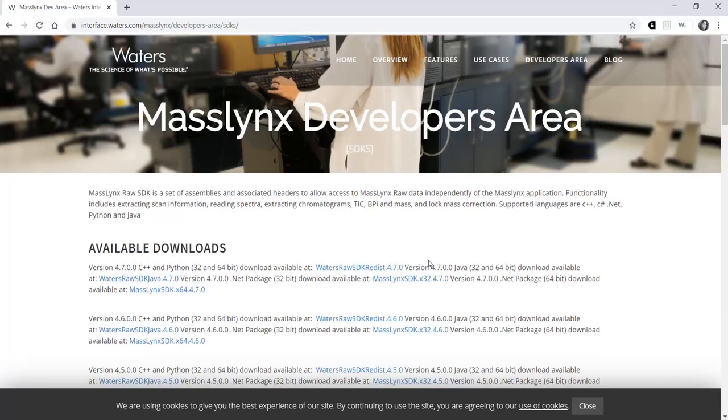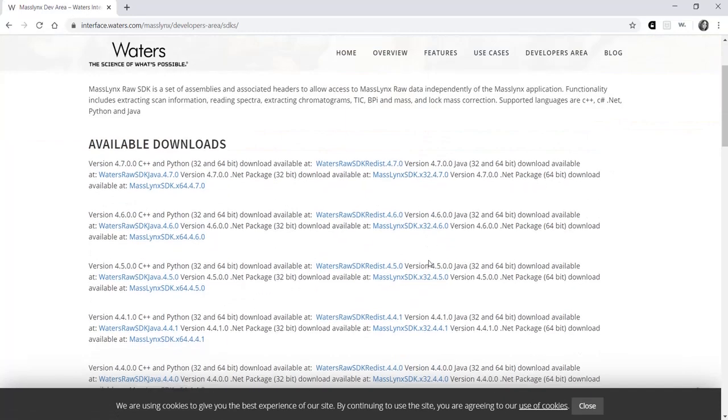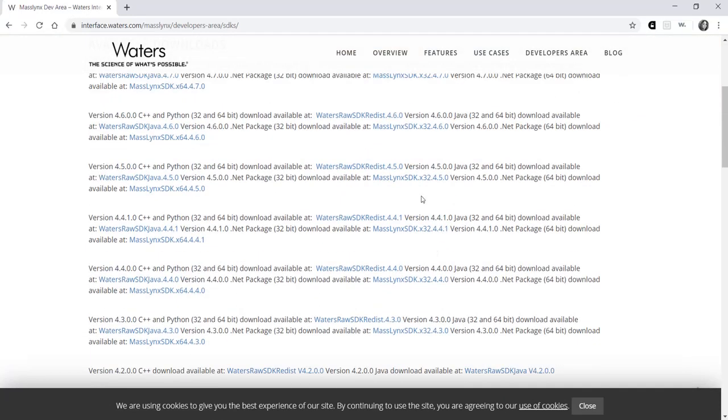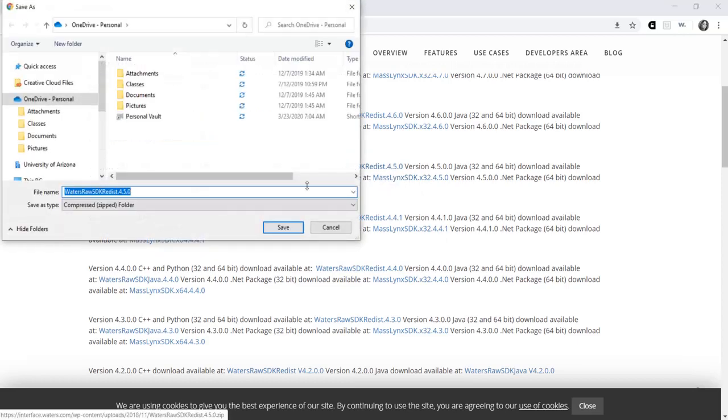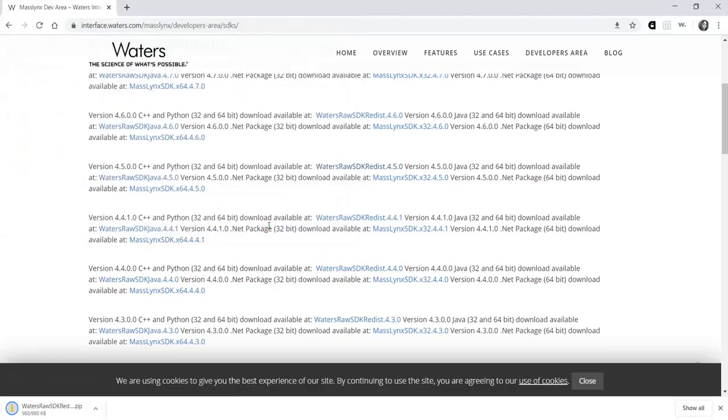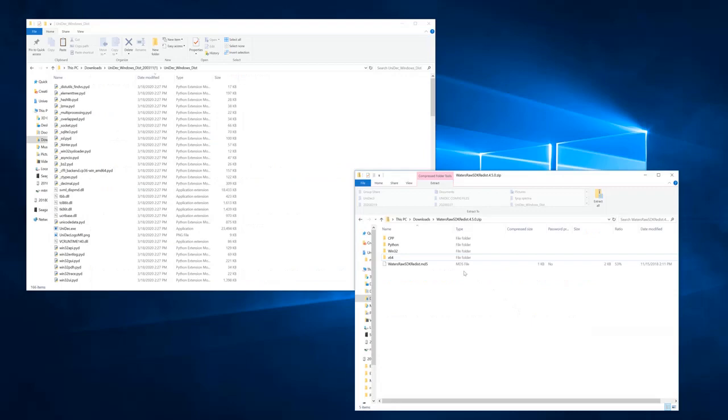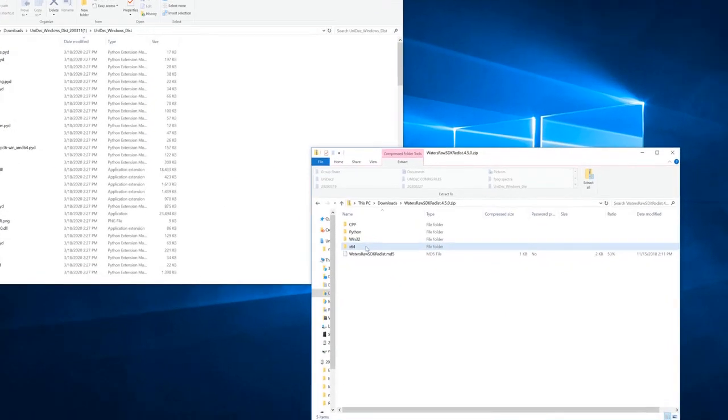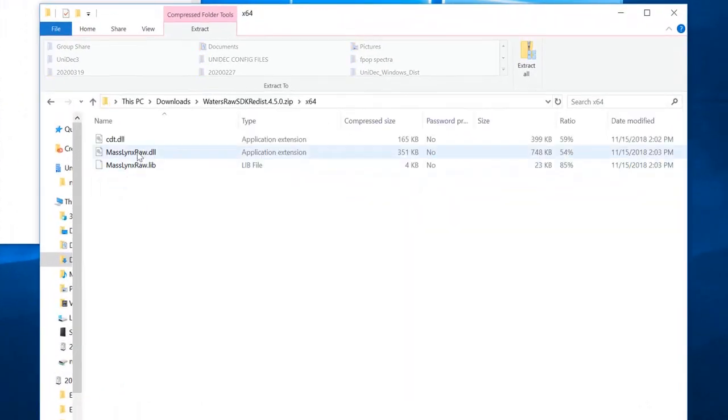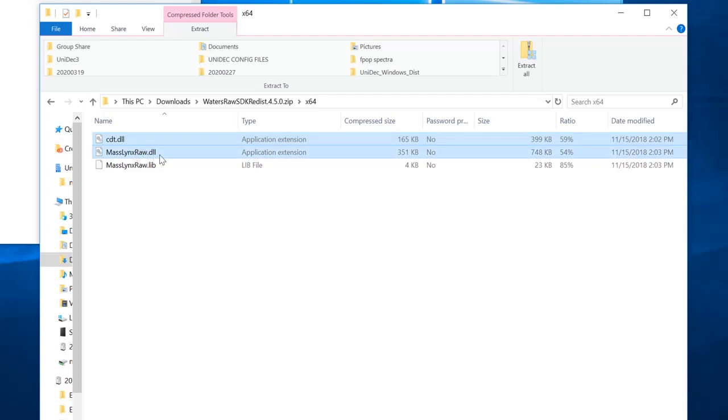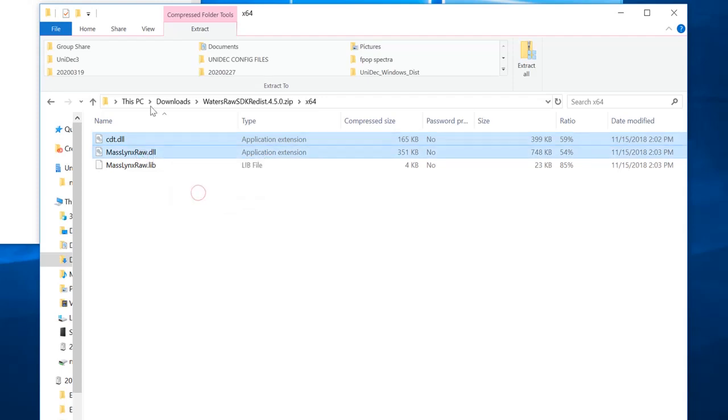Scroll down until you find version 4.5, click it, and save. Open this file and then the X64 folder. Within this folder are the two DLL files that you need. Copy and paste these into the Unidec directory.